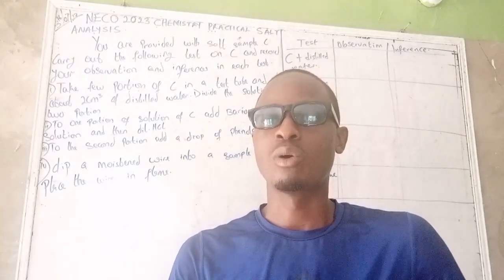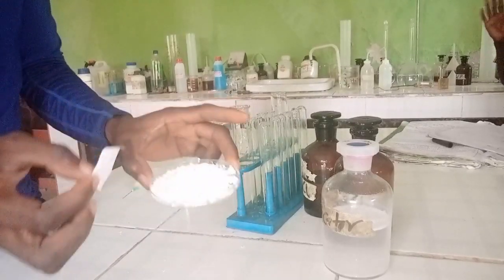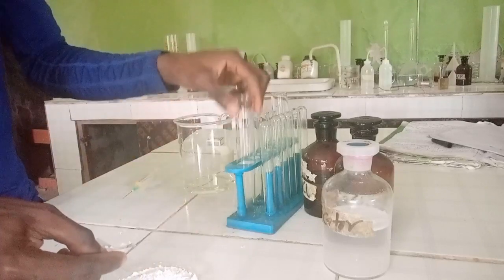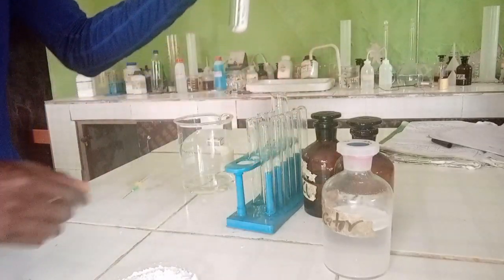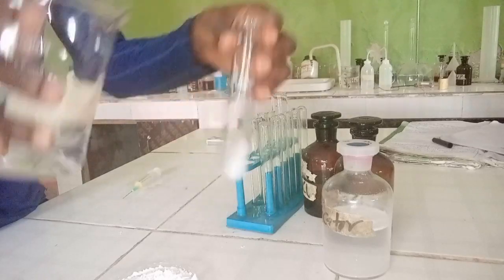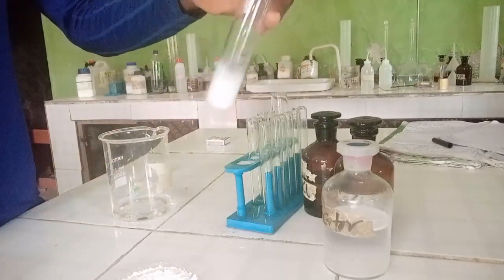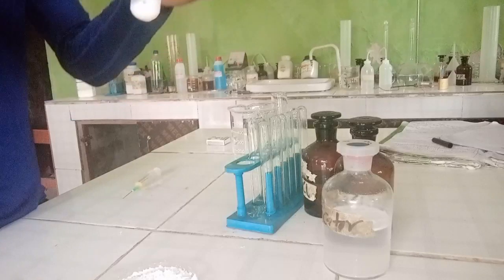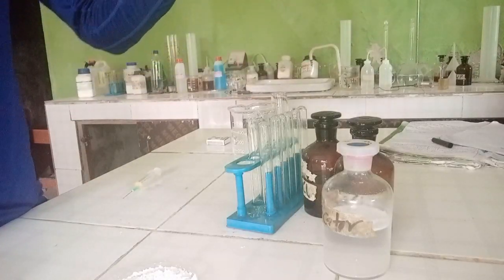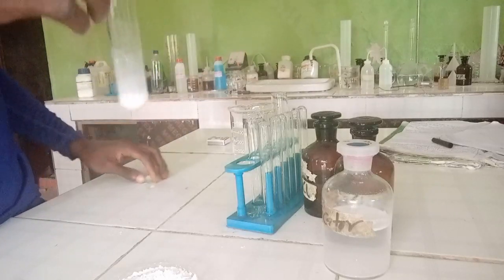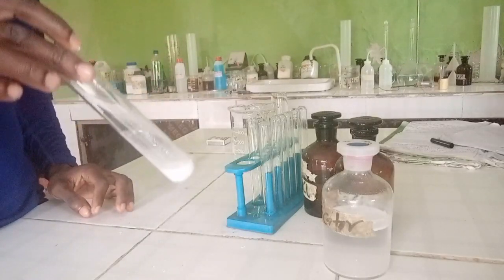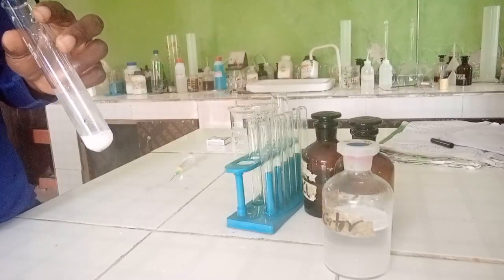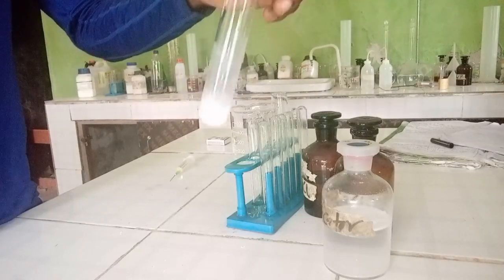So let's carry out the practical so you can see everything and record the observation. This is sample C — let's add this sample into the test tube. I'm going to use a boiling tube here. I've added it and now added about two centimeter cubes of distilled water. The solution turns white and soluble because no particles are found — it turns into a white solution with no particles present.